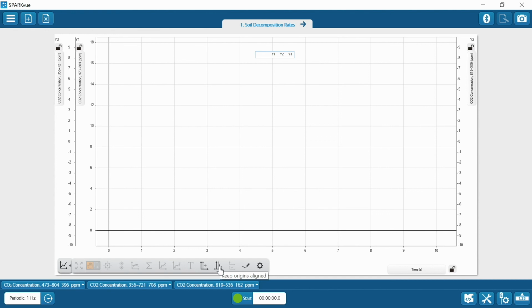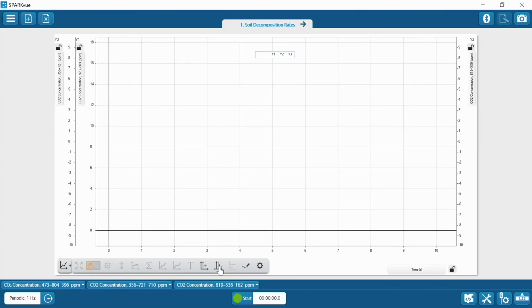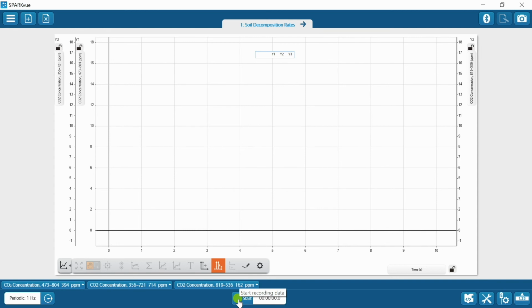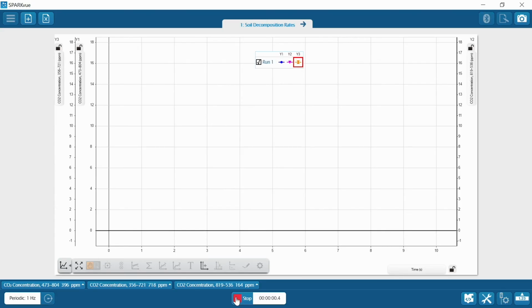Now, right next to adding a new sensor, there's an option that's going to bring some value in: it causes these all to be on the same scale, which is really nice. So I go ahead and click that. I can see in the bottom here all the values that they're measuring. And even if they don't start out the same, because it's been sitting here for a little while as we're setting this up, I am going to go ahead and start these, and we're more interested in the rate of how much production is going on. So let's go ahead and start those.